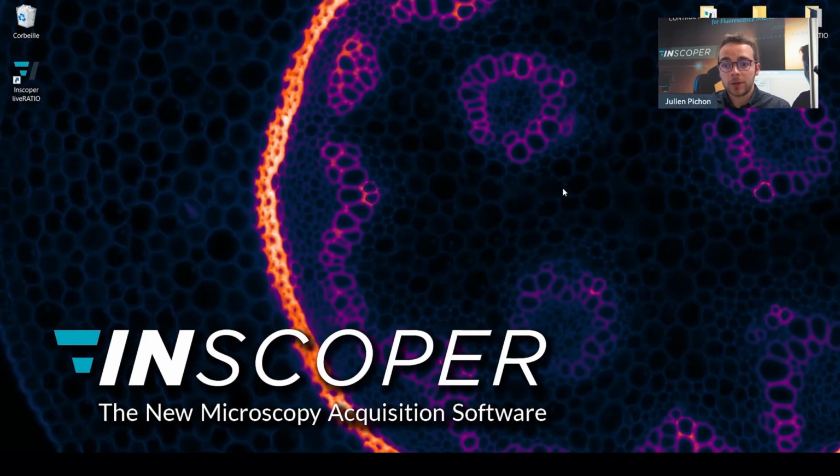For this demonstration, I will show you the activation of gamma delta T cells following phosphoantigen stimulation. For that, we label these cells with fura2 and monitor the calcium flux as an indicator of their activation. The fura2 is a fluorescent probe often used for ratiometric imaging of calcium. By switching the excitation light from 340 to 380 nanometers, it is easy to differentiate the calcium-bound from the calcium-free probe.